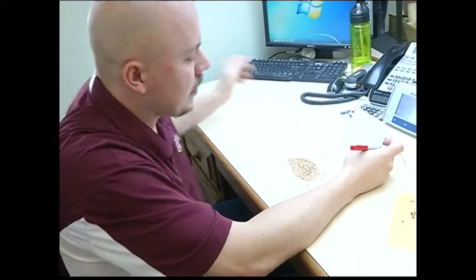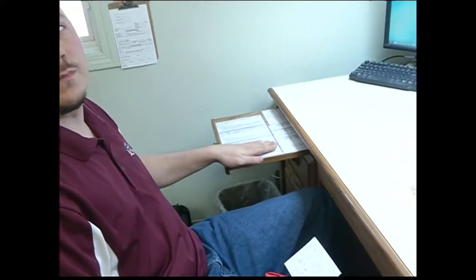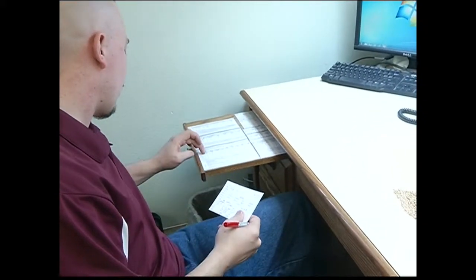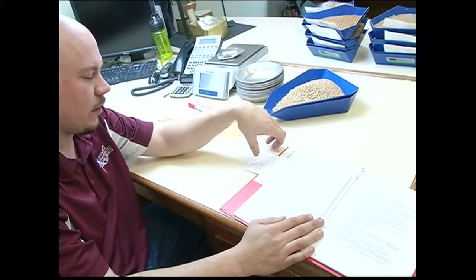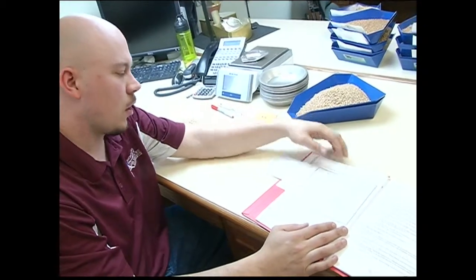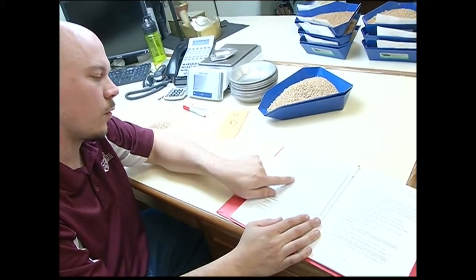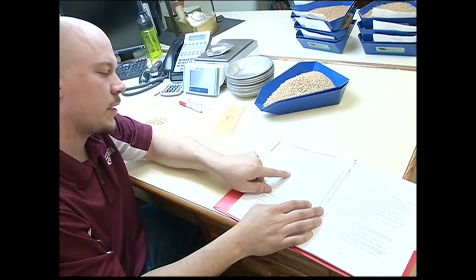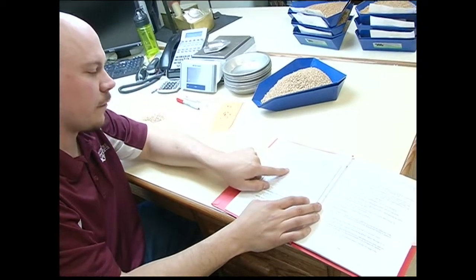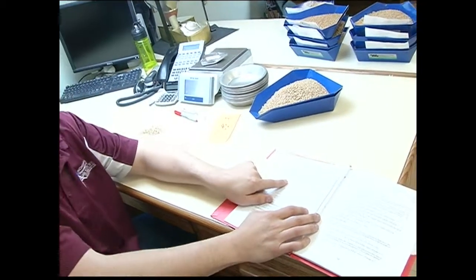Once he's done analyzing, Lauren gives the sample a grade. This particular batch had 4 stones and 12 rodent pellets, making it sample grade, the lowest rating on the scale. Farmers strive for a U.S. #1 grade on a scale that goes up to 5. So if this sample did not have any stones or rodent pellets, according to my test weight, I would look over here for winter wheat. Minimum limits for test weight is 56 for number 3, and I had a 57, so I'm above the minimum, so that would make this a number 3 hard red winter.